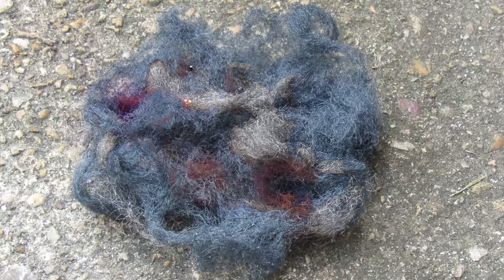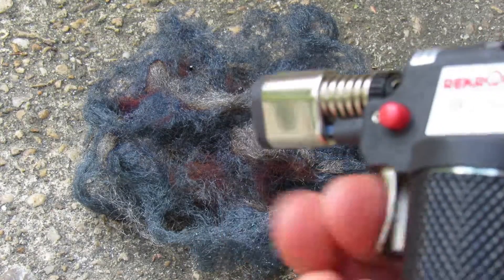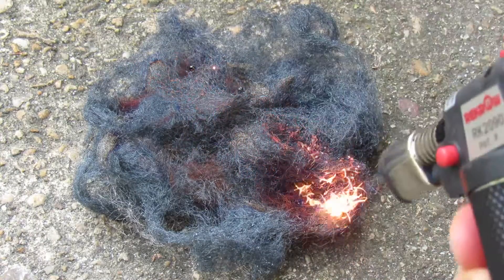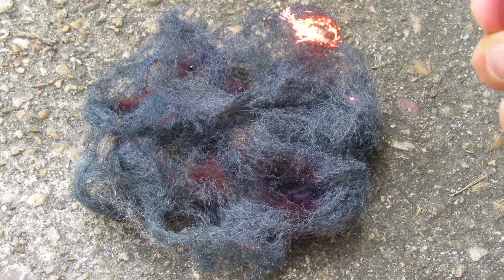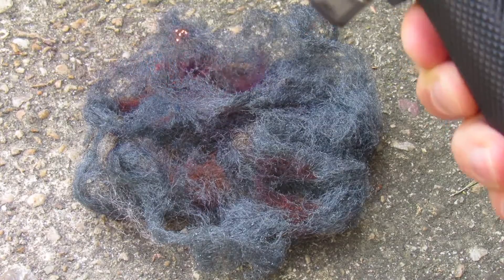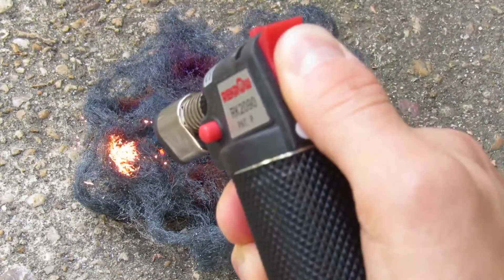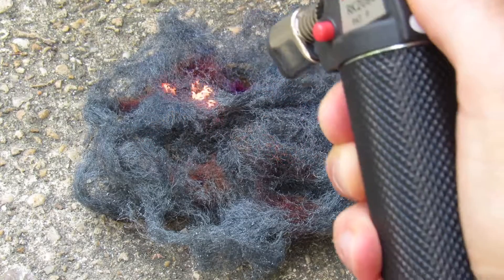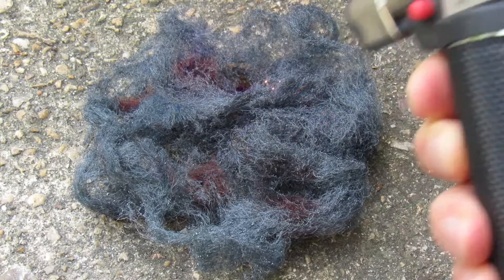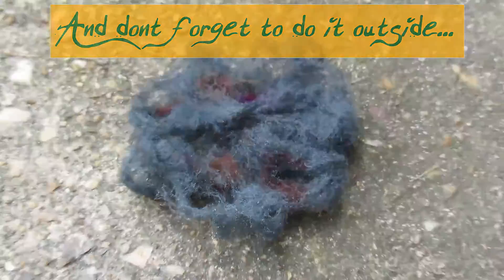Okay, it's basically done. There's a couple of little spots left and if you want you can take your torch and make it go even crazier. There's a little bit of iodine left you can see. That's quite a mess. Pretty cool experiment you can do with simple stuff — you don't even need the iodine, just the steel wool itself does this with a battery. It's a fun experiment. Smoldering steel wool with iodine — and we're done.